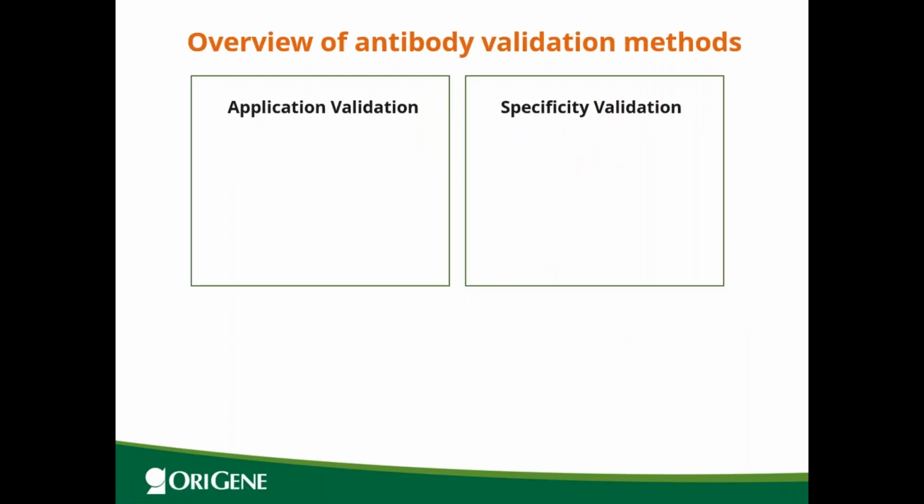So how do we validate the antibodies at OriGene? In this slide, I have classified the validation methods into two different categories: application validation and specificity validation.